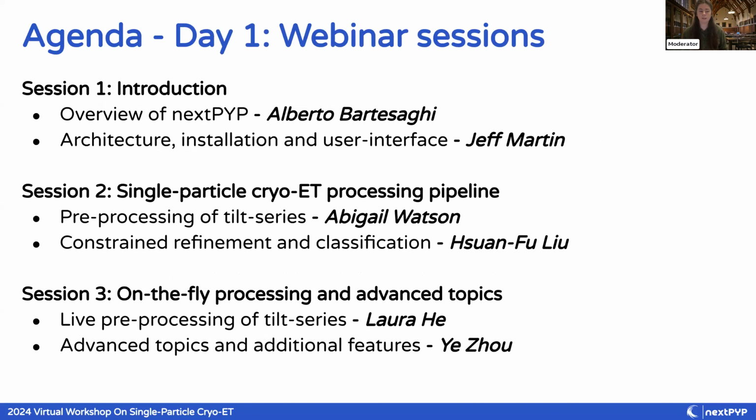And then the last session of the day today is going to be on-the-fly processing and advanced topics in nextPYP. Live pre-processing is going to be covered by Laura, and then advanced topics and additional features will be covered by Ye.